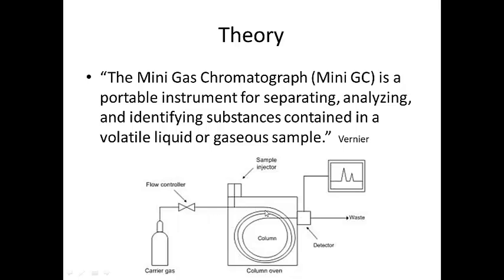And compressed air is forced through something called a column. And the column is filled with our stationary phase. It doesn't move, but the sample, which is injected in this sample port and moved along with the carrier gas, is passed through that stationary phase, depending on its properties like boiling point and size, so molecular mass, its polarity. All of these things will dictate how it interacts with that stationary phase and how long it will stay.